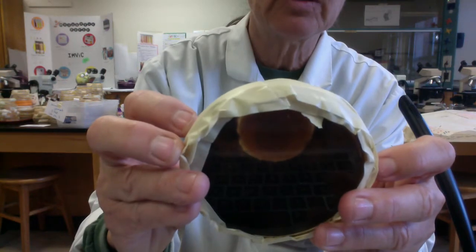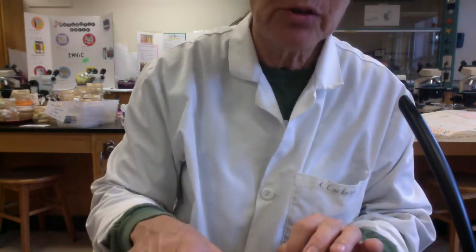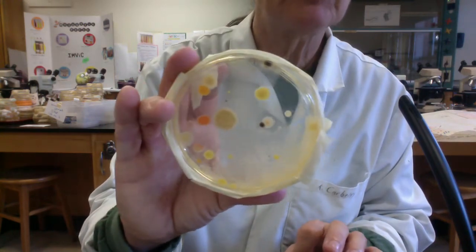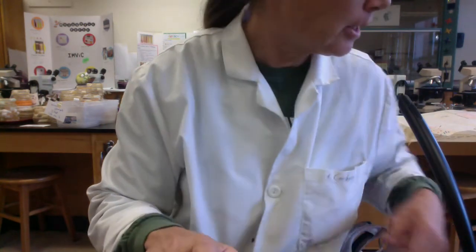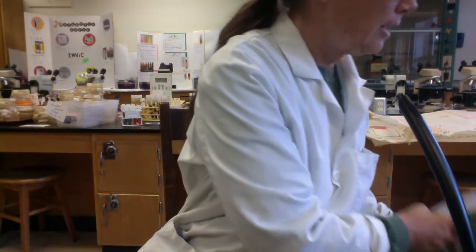these are just remarkable. What we'll have you do eventually is choose 2 different colonies. It can be from any plate, and you're going to describe the colony morphology. We'll have a handout for you.